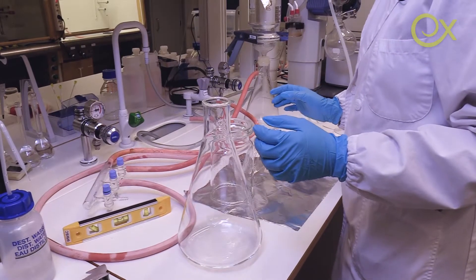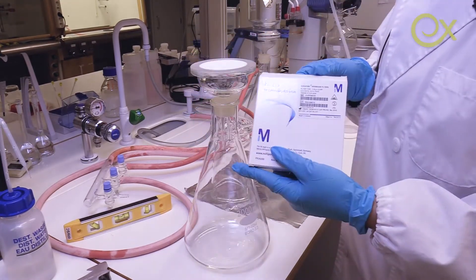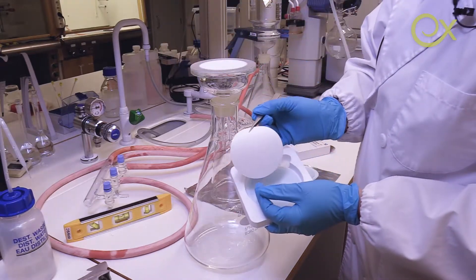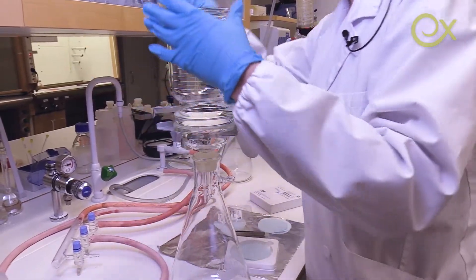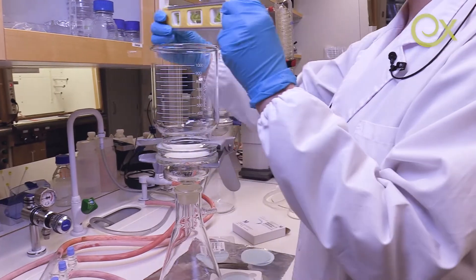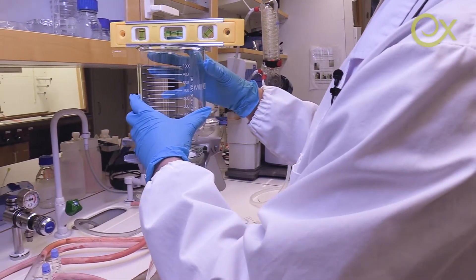Now we have to prepare the filtration unit with the Durapore filter paper. I also need to adjust the levels to make sure that our nanopaper will be uniform and homogeneous in all directions.